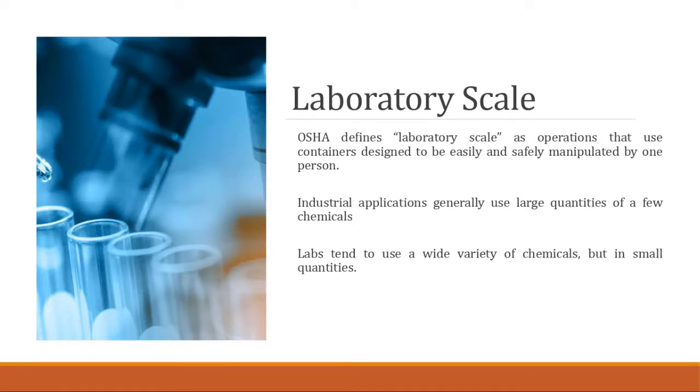Okay, our labs typically use a wide variety of chemicals because we're in the realm of using a wide variety of materials, and not all materials react the same to a specific chemical. But we don't need thousands upon thousands of gallons of sulfuric acid the way the copper refinery industry uses it to refine copper. So in this case, we have a wide variety of chemicals, but in much smaller quantities. Those quantities are anything from a liter and below.